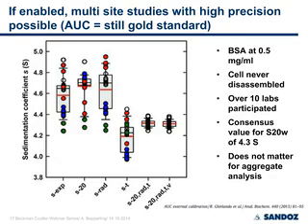It's really useful to enable those corrections, because it underlines the value of AUC as still being the gold standard for measuring particle or protein sizes in solution, without the need of introducing calibration proteins, so without calibrating S values by a run molecular weight standard like in size exclusion chromatography. So I would recommend using it.